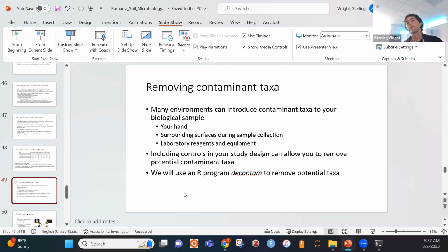So you have to think about this. They're kind of independent. Bacterial genome size is sort of independent. You're mapping your reads, in most cases, to multiple genomes, and it's about which genome your sequence best aligns to.